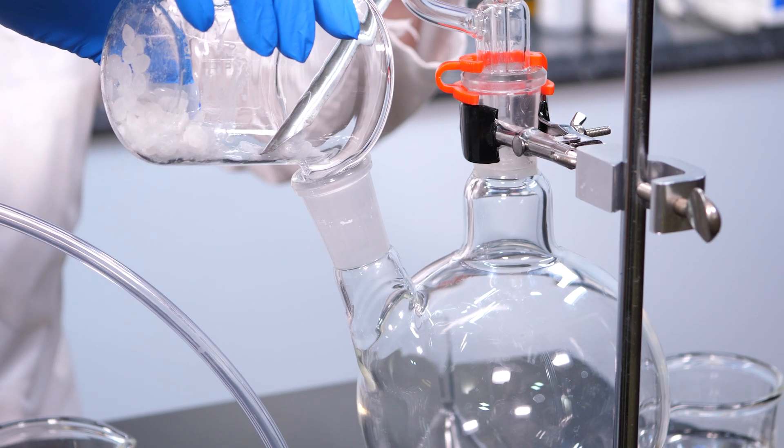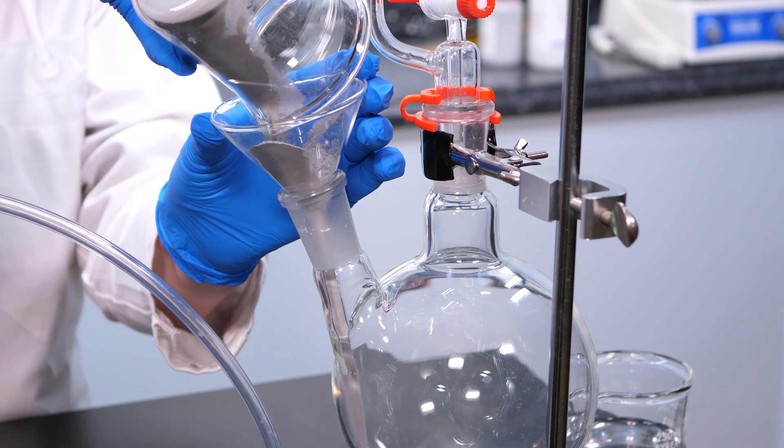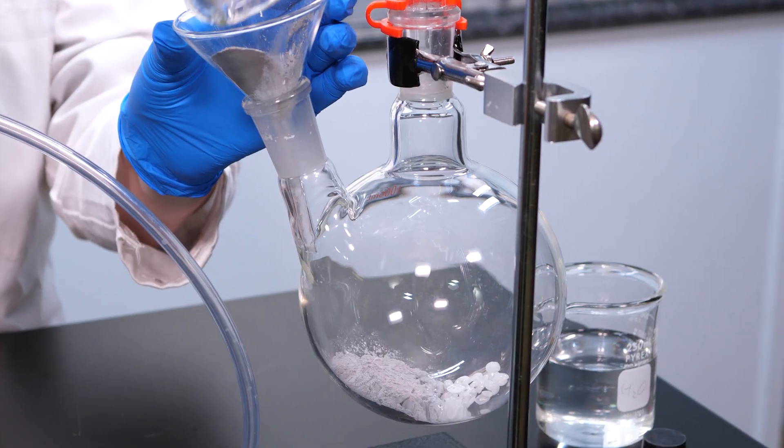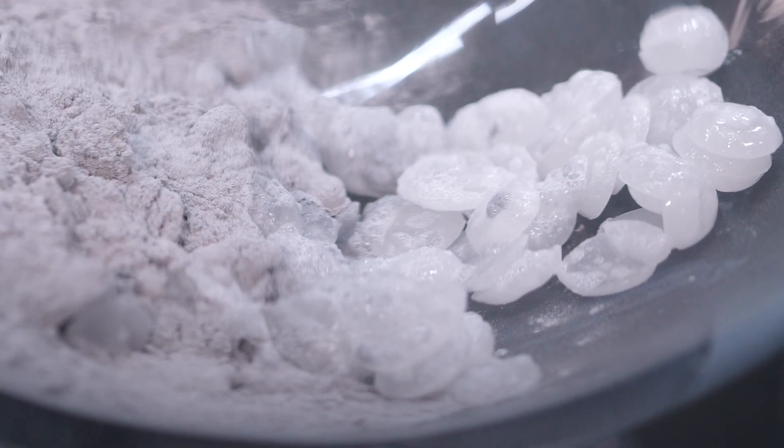First, we add solid sodium hydroxide to this reaction flask. Then, we add the aluminium powder. As you can see, the reaction is taking place slowly.